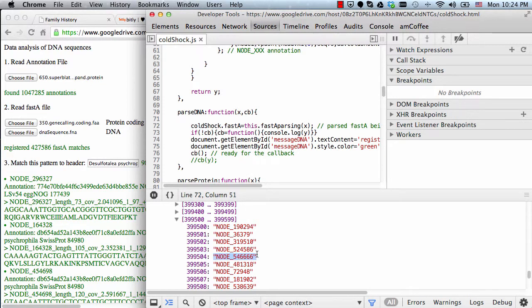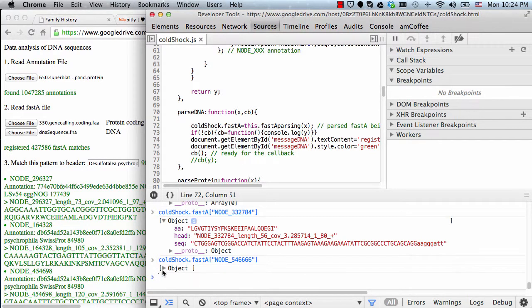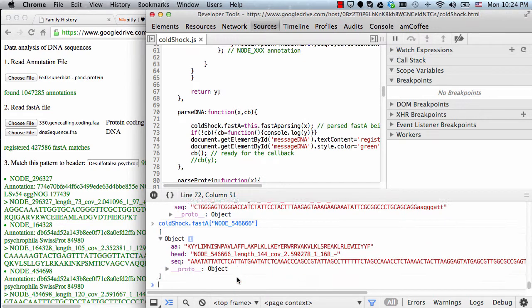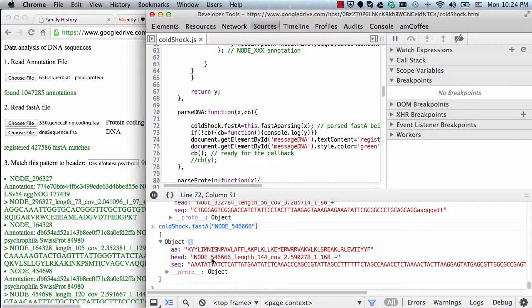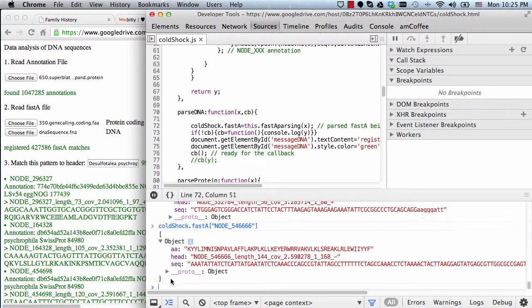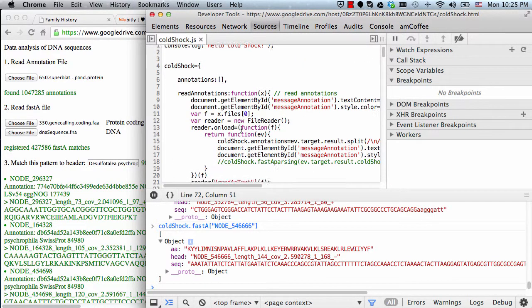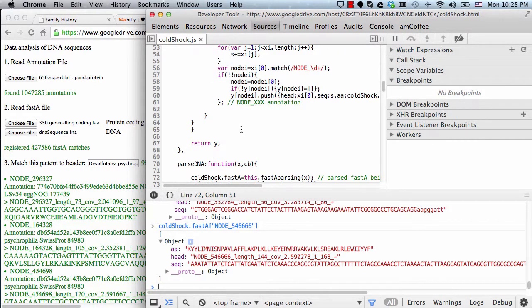Alright. Let's change the nodes. Again, only one entry. And there we are. We have the nodes information and the two sequences. Let's go to the end. I guess that was an isolated problem over there. Alright, let's see. Cool, so I suggest you now go over the object and find out if you understand the methods that were coded here.